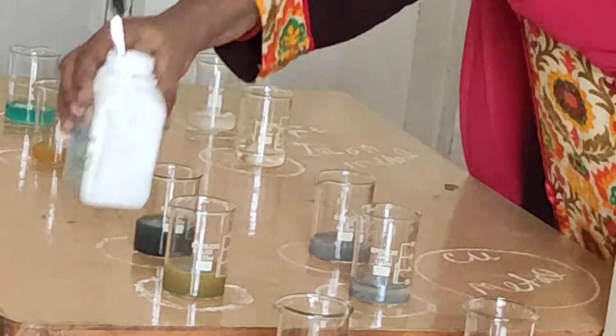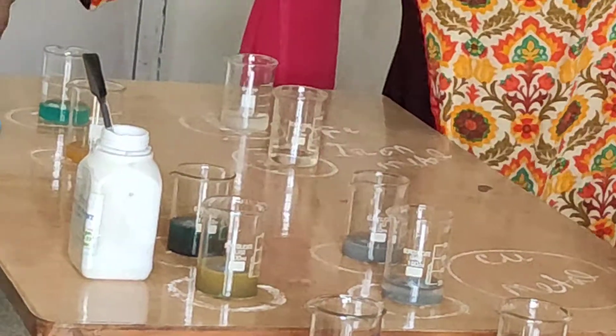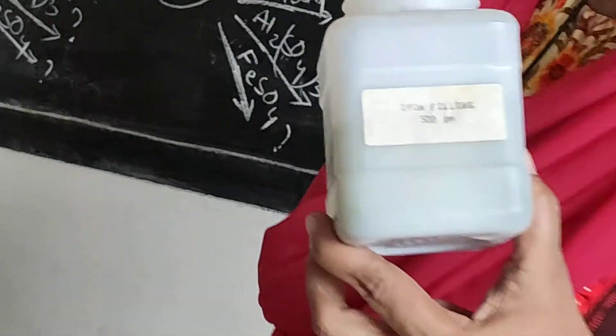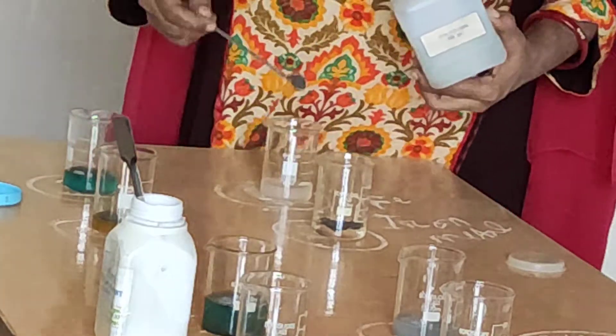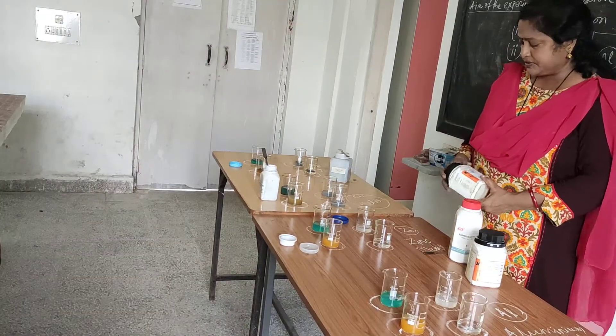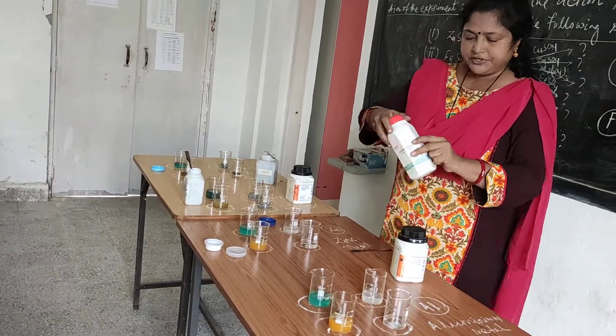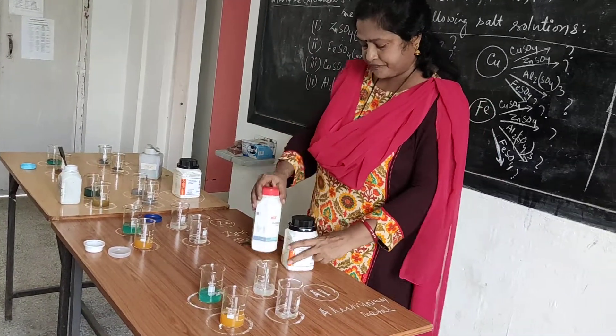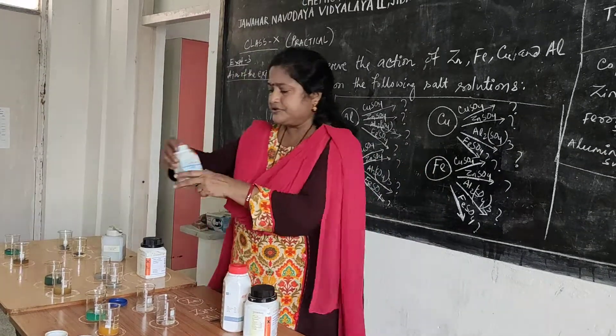The 4th one is your iron filings — this is your iron powder. In the 4th table, I am adding iron to all four beakers. So now you have: iron, zinc, and aluminium — all metals added to their respective tables.